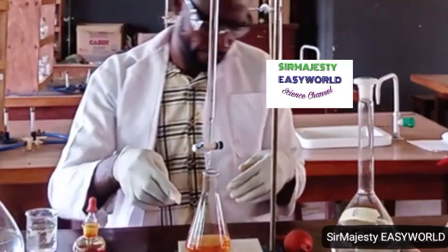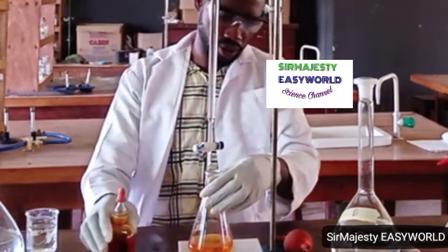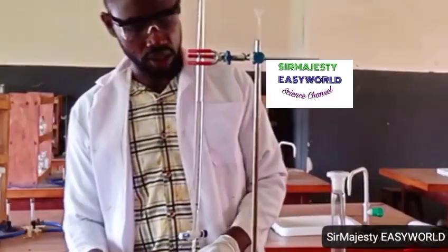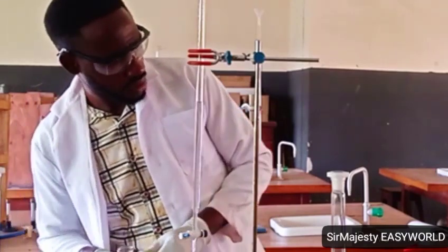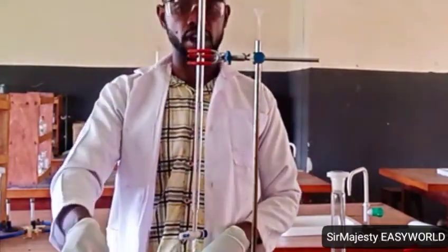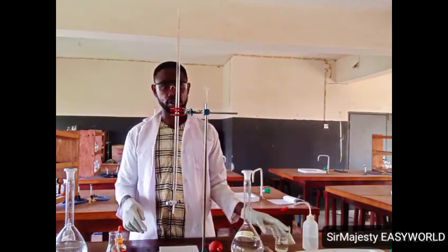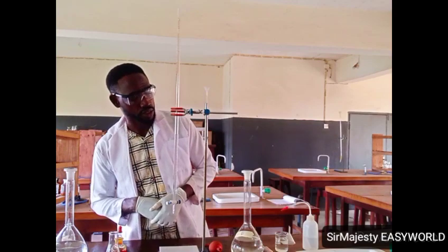We are there. Slightly, these two colors are not the same. Confirm. So this is the methyl orange indicator endpoint, and here it's giving me 34.5. So this is 34.5, and the other one was 10.5 for the phenolphthalein. The phenolphthalein gave us 10.5, whereas that of methyl orange took it down to 34.5.